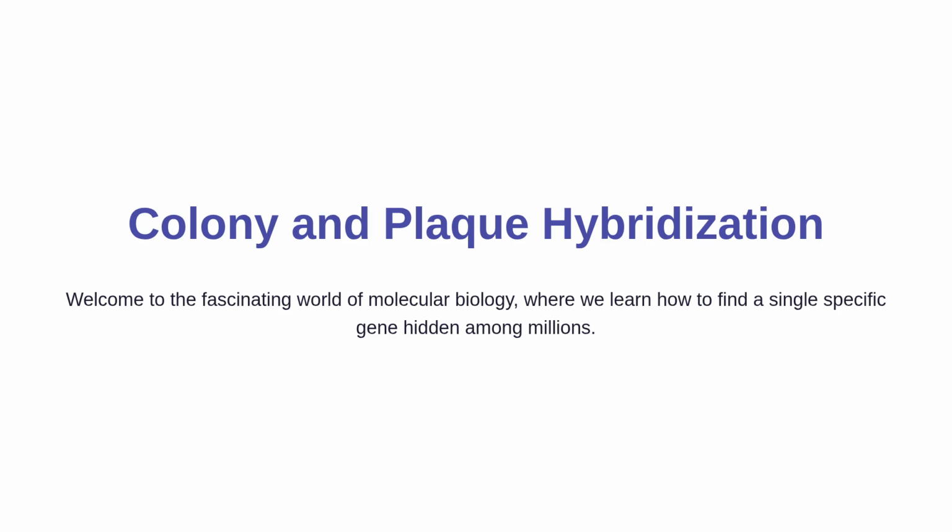Welcome to this lecture on animal biotechnology. Today, we are diving into a fascinating and essential topic, colony and plaque hybridization. Imagine trying to find one specific person in a crowded city of millions, but you have a magical spotlight that only shines on them. In genetic engineering, we face a similar challenge when looking for a specific gene inside a massive DNA library. This technique is exactly that magical spotlight.